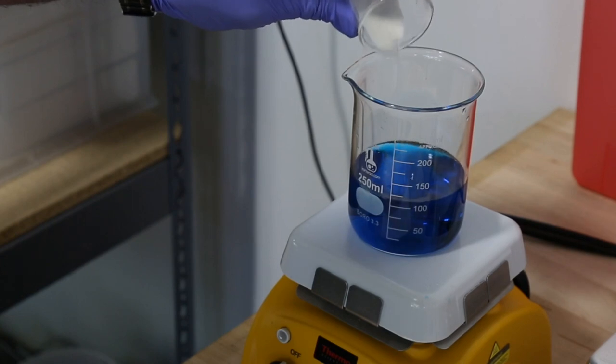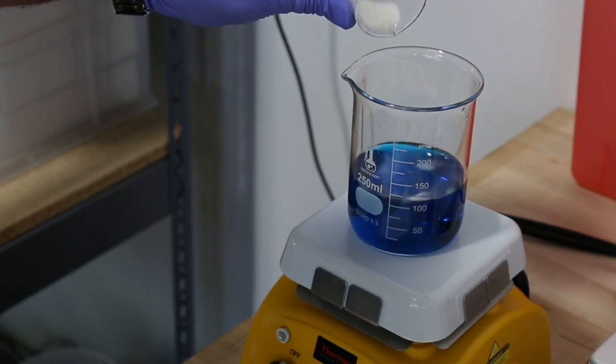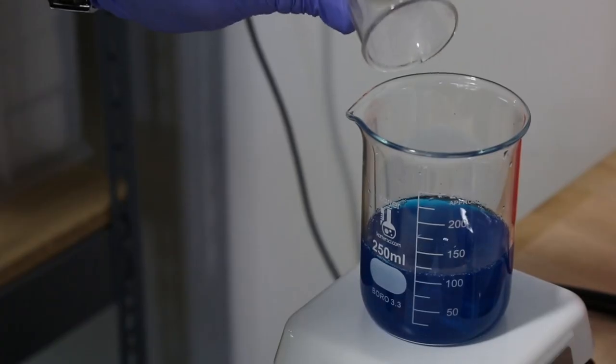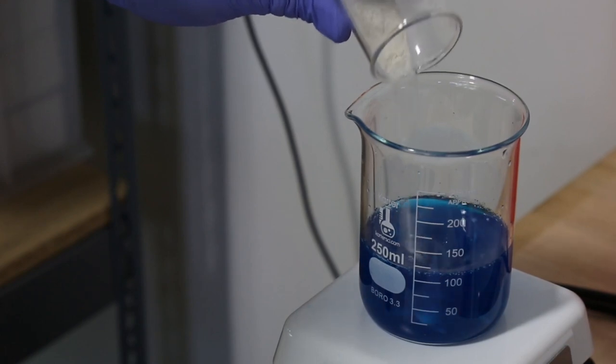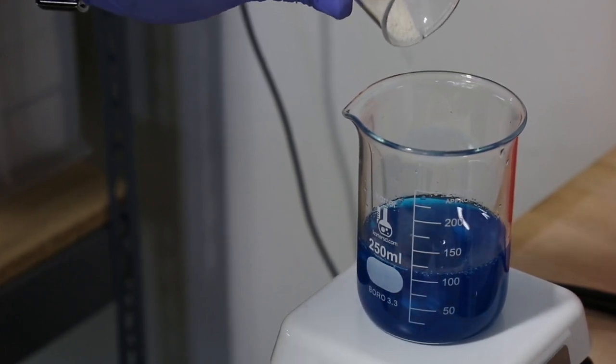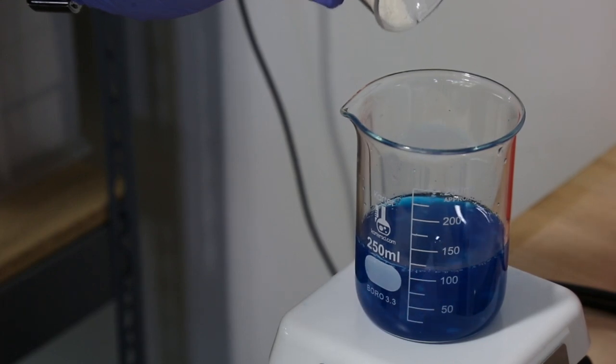And then we're gonna slowly add our 2 grams of sodium alginate powder. Because the sodium alginate wants to clump together, we're gonna have to slowly add it and mix it for a few hours so that it reaches a consistent viscosity.